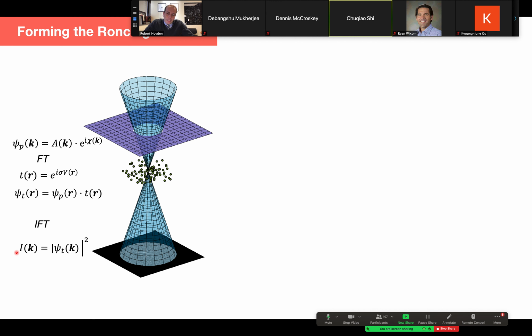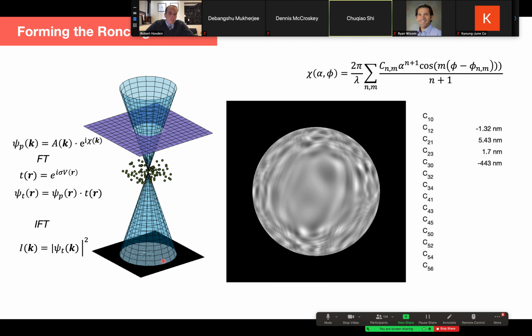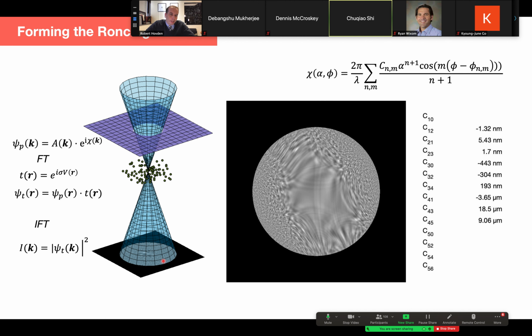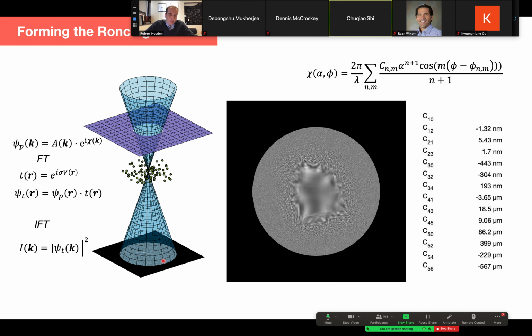What we measure in quantum mechanics, again, is the amplitude squared of the wave function. So we lose the phase information. And this is our Ronchigram. So we can run simulations for any aberration function. And we can do it efficiently with just a couple Fourier transforms. Here I'm showing Ronchigrams as we're adding higher and higher order aberrations. And what you'll notice as more aberrations come into the simulation, the region of phase variation on the outskirts increases and the region of high magnification in the center, the uniform phase, gets smaller.